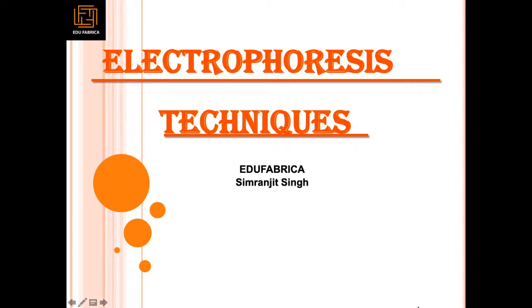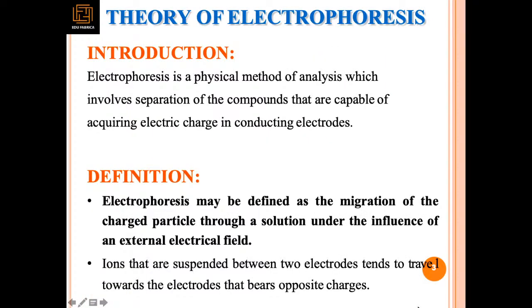So we are done with the DNA isolation PCR. Now comes the next technique, that is electrophoresis. So we will mainly go through the theoretical part at this moment, with PPTs, but later on I will switch to some very nice virtual workshops also, so that we can understand them from a practical perspective.